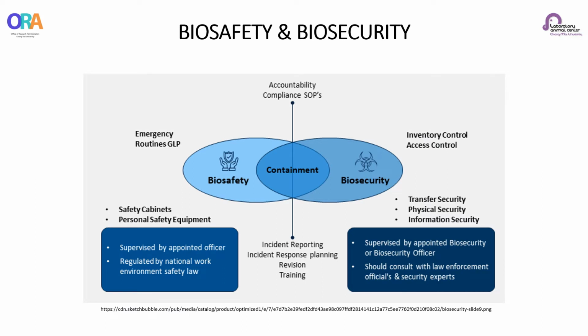Biosafety and biosecurity: although the term biosecurity can have several definitions, the BMBL 6th edition describes laboratory biosecurity as referring to measures designed to prevent loss, theft, or deliberate misuse of biological material, technology, or research-related information from laboratories or laboratory-associated facilities. The term biosafety is related to biosecurity, but they are not the same.